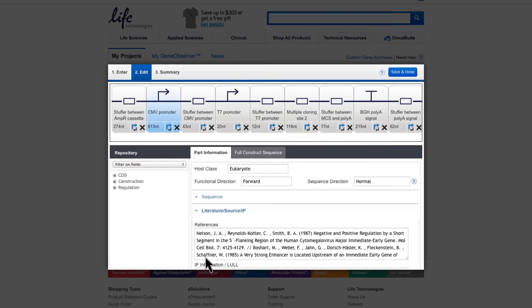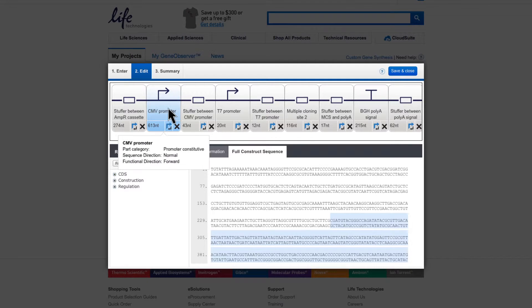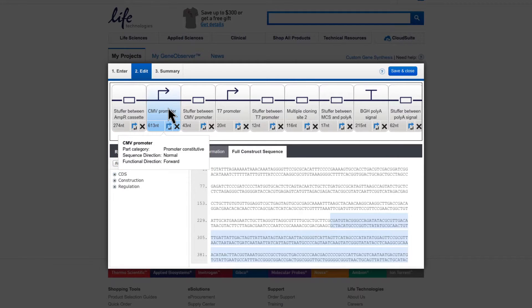You can also review the sequence for the whole construct by switching to the Full Construct Sequence tab within the Information pane. The sequence of the elements selected in the Construction pane will be highlighted within the sequence. Hovering over the elements within the Construction pane will also give you some information on the respective element.